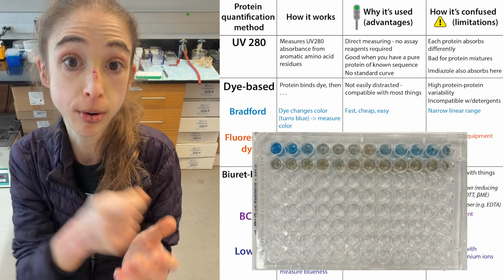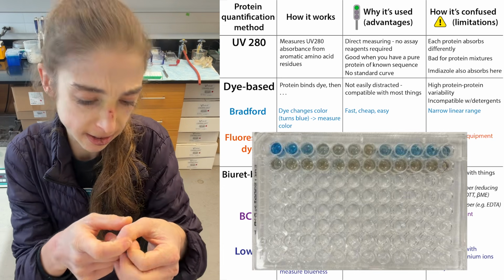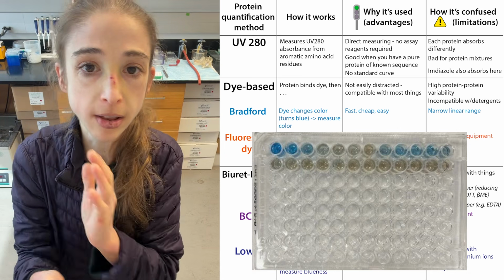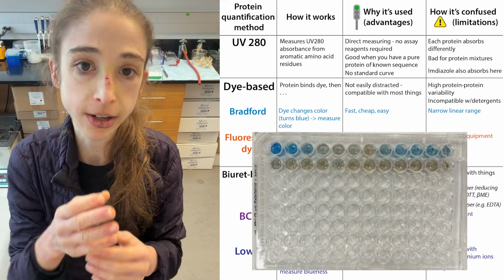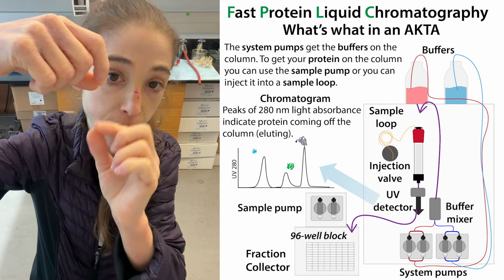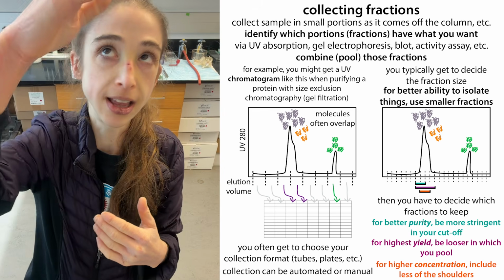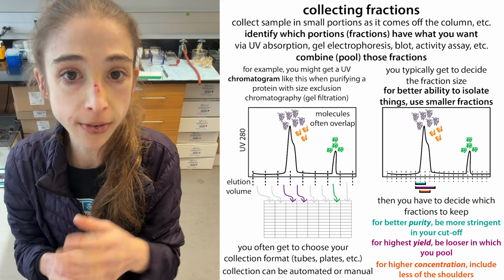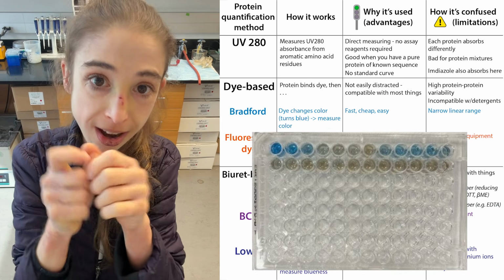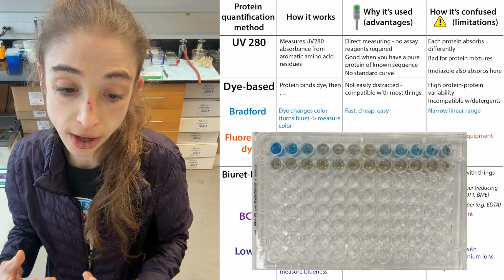You can just mix some of your protein with some Bradford, even in a microplate without even measuring the microplate, just as a nice little convenient receptacle, and then you can see, okay, protein is still coming off my column, protein's coming off my column here, this sort of thing, when you don't have a UV monitor with an FPLC, some sort of ÄKTA or other protein purification machine. There, it's coming off a column and going through a UV detector, and you're measuring the UV280. Not to quantify it, but just to get a relative amount and see when protein is coming off and in what fractions. If you're doing gravity flow, you just have liquid flowing down through the column and coming out, and you can check it with a quick Bradford to see, okay, is it turning blue?